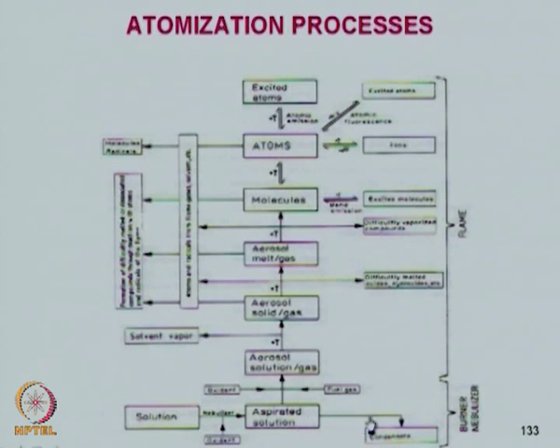In between, the bigger drops condense and get out, they are collected and thrown out. The sample solution is taken up, which forms an aerosol of solution and gas.